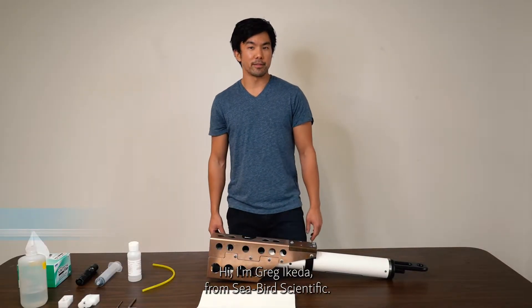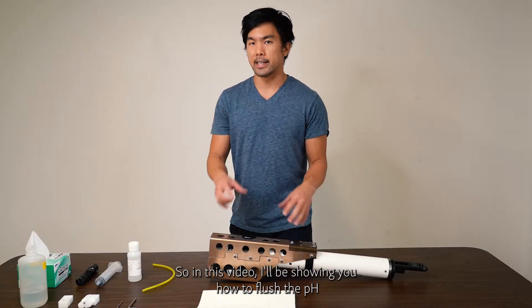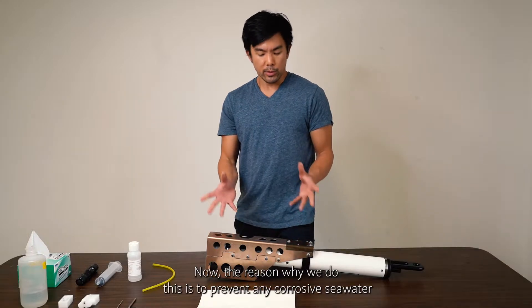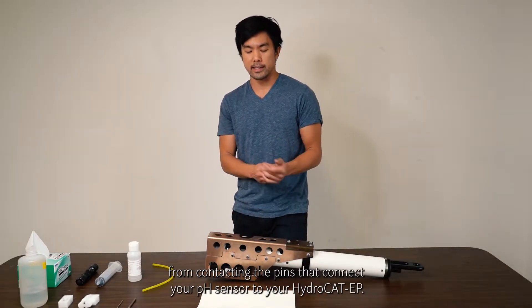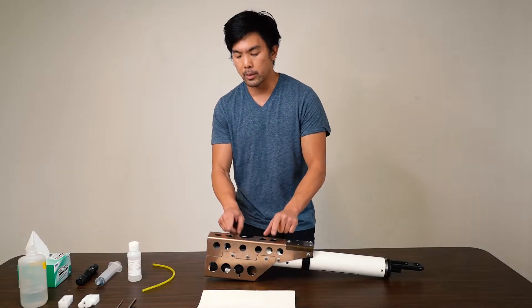Hi, I'm Greg with Seabird Scientific. In this video, I'll be showing you how to flush the pH sensor on the HydroCat EP V2 after deployment. The reason we do this is to prevent any corrosive seawater from contacting the pins that connect your pH sensor to your HydroCat EP.